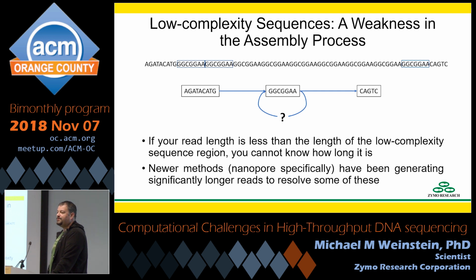So is this a 1,000,000 base block? Or is this just a 100,000 base block? It's hard to say if you can't read all the way through it. This was a huge problem with genome assembly before. Having nanopore now is helping a little bit because we can get through a lot of these very long stretches, so at least we can say this is a block of at least 100,000. Or occasionally we can read from one end to the other and have a pretty good idea what the size is supposed to be, but this is one major weakness.